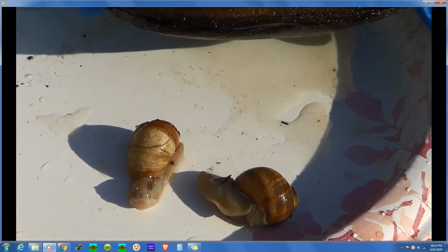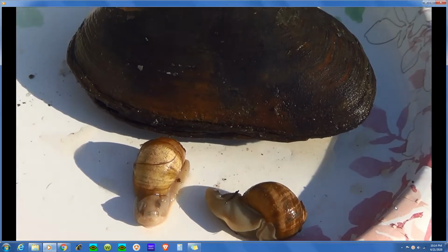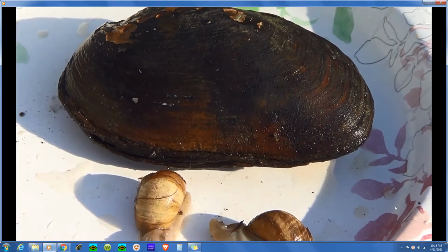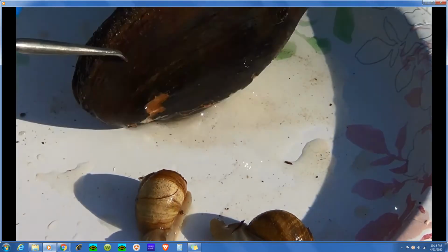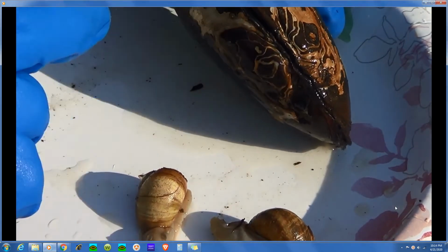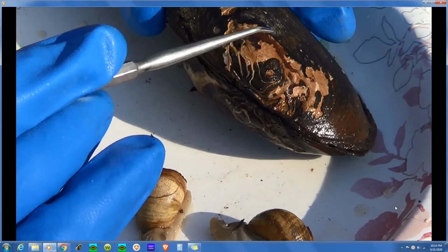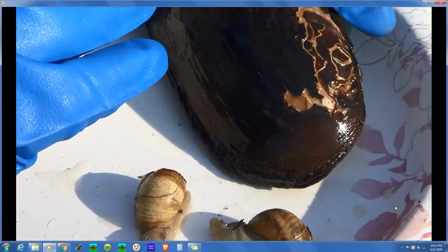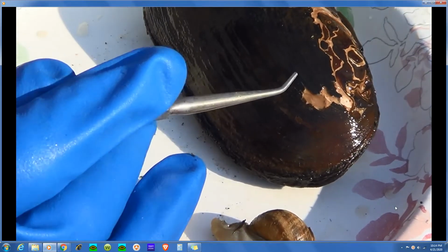And to begin with, because it's the simplest to look at, we're going to look at the freshwater mussel. Now, the mussel is, and it's not muscle like your biceps or the muscles of your body. It's mussel, and the mussel is a kind of clam. It is a bivalve. It has two shells that are hinged. There's a hinged ligament back here. There's a little raised area that's the primitive embryonic shell called the umbo. And then if you look at the shell, you can't really see it in the video, I'm sure, but you can look at diagrams. Maybe this one's dried out so you can see it better.